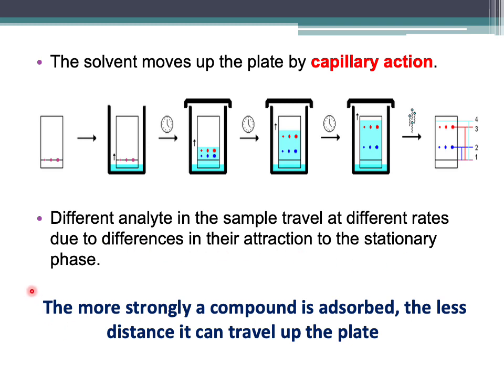Okay, macam mana dia berlaku pergerakan tu? Macam mana berlaku separation tu? Separation tu berlaku disebabkan oleh perbezaan attraction, perbezaan tarikan dengan stationary phase. So yang tarikan kuat dengan stationary phase akan tertinggal dahulu. Yang kurang tarikan dengan stationary phase akan bergerak naik ke atas.